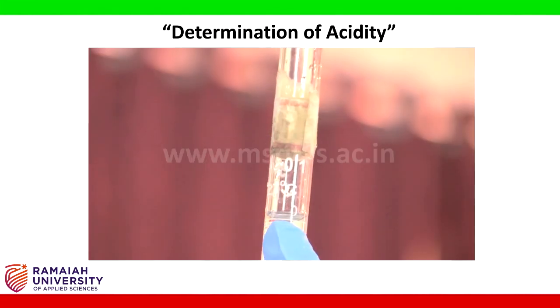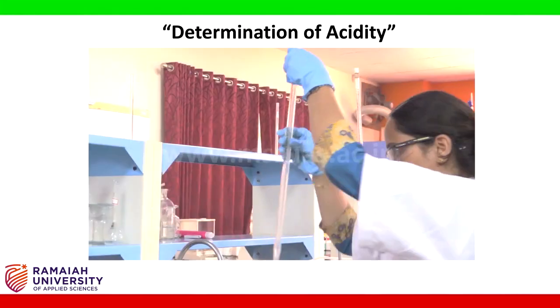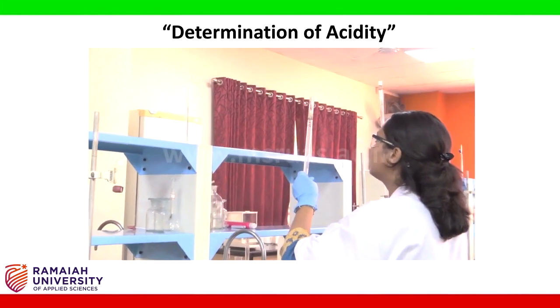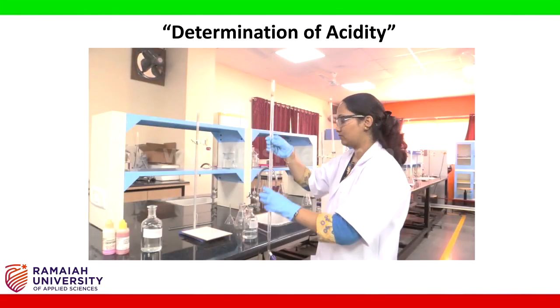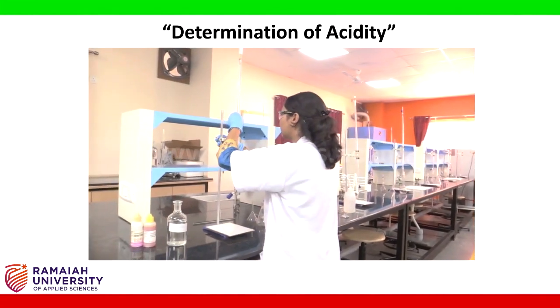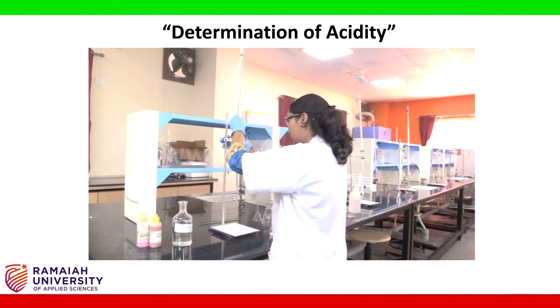Adjust the quantity to 0. Place the burette in the burette stand.